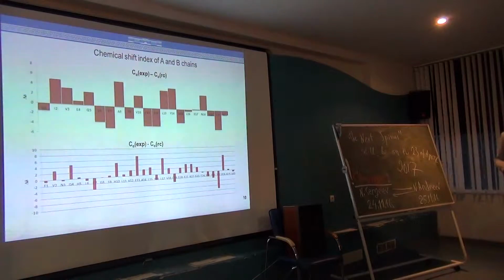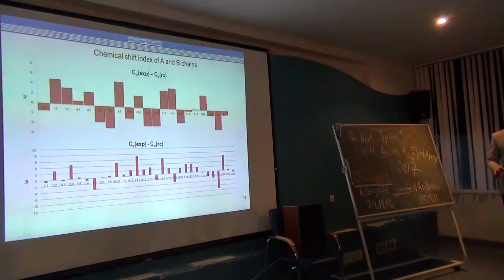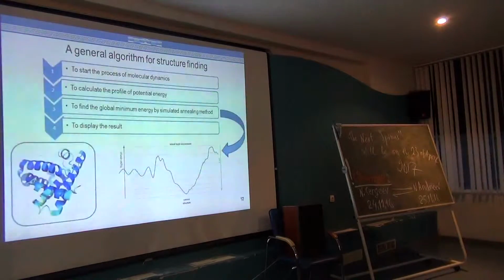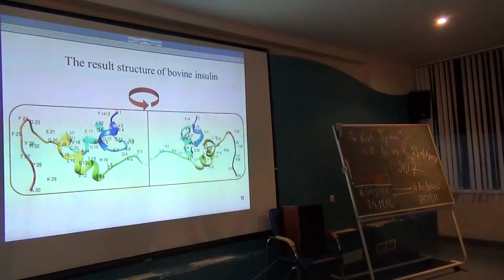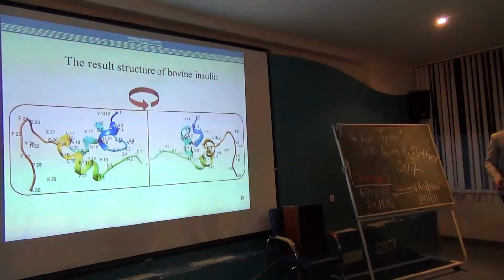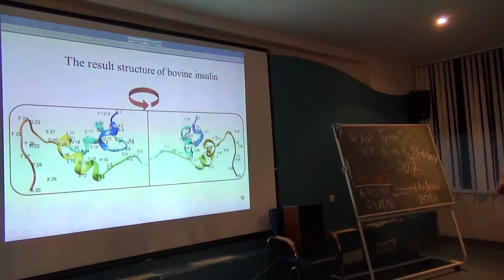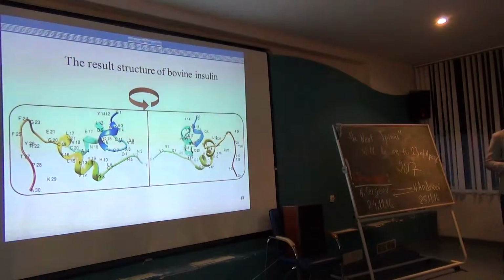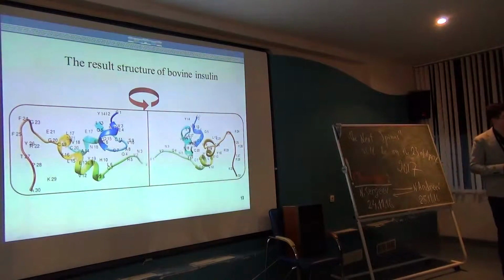Is this secondary structure consistent with the secondary structure in the model? I think yes. We see at the beginning a helix in the A chain, a helix in the tail of the A chain, and the long helix in the B chain. But I can't see any beta sheets in this model. Beta sheets form only upon oligomerization. Okay, it's from articles.